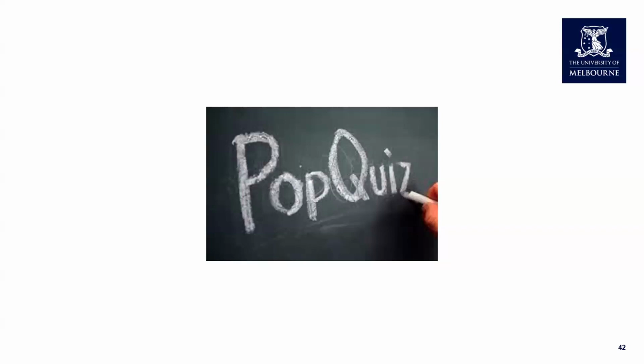So we don't really want to apply a different type of algorithm for each image. Maybe the answer was not very clear. Essentially, what we want to do is use a single auto threshold algorithm for the entire data set. Hopefully that makes sense. That's the more objective way of setting the threshold.